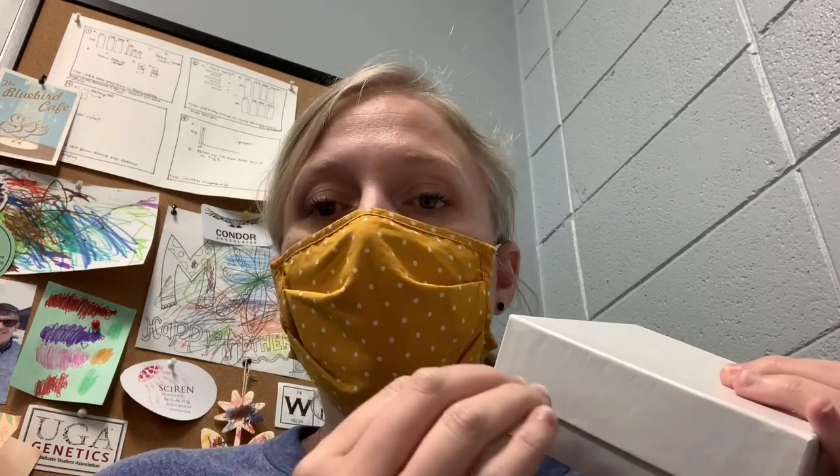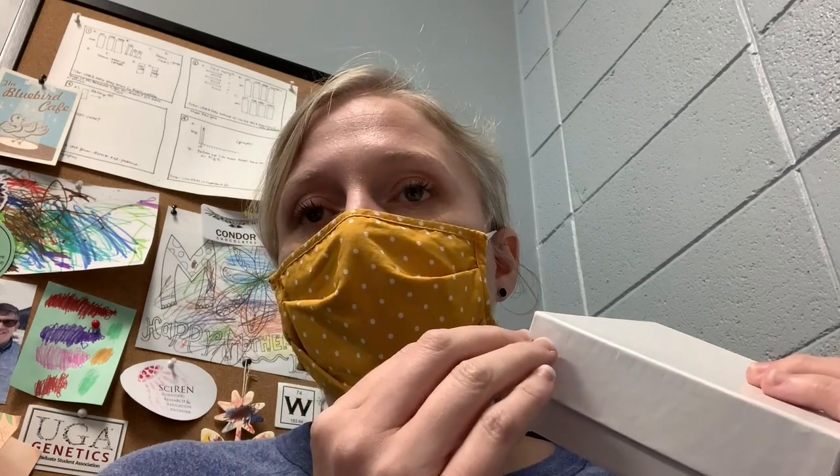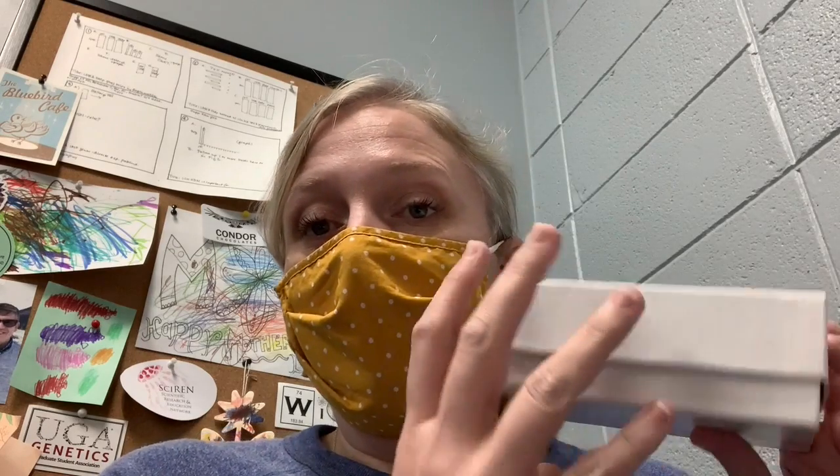For the mini preps, and especially as you're generating one of these plasmid collections, as you sequence plasmids, you know they're correct and you want to keep them. I have a set of plasmid collection boxes that are separate from my other boxes, and as I put those into my Excel spreadsheet, I put them into a physical space as well. Okay, so if you keep these boxes organized, that will help you, but also you need to make sure you put information on tubes.